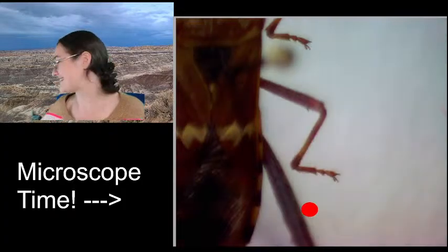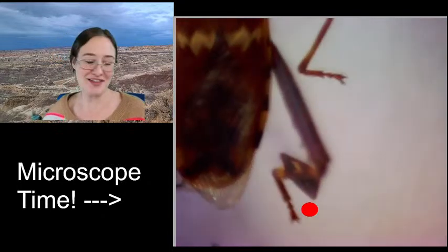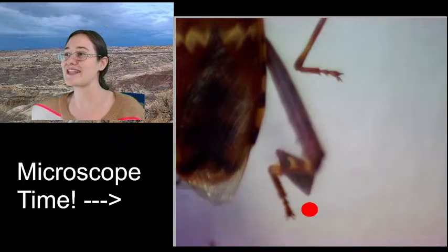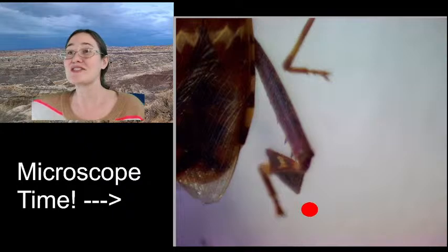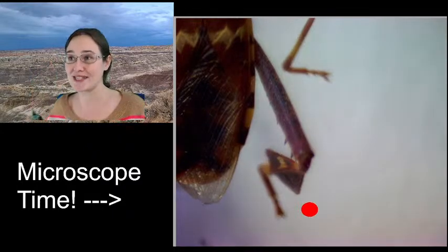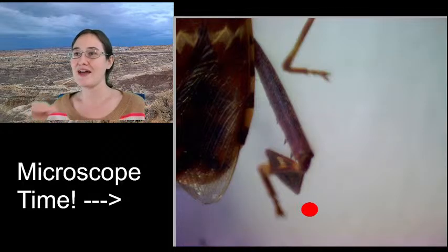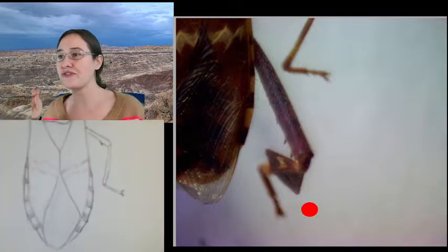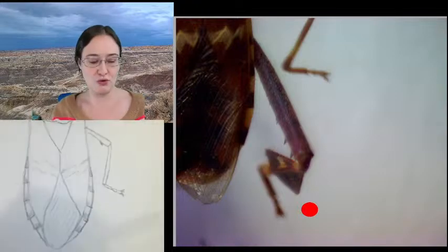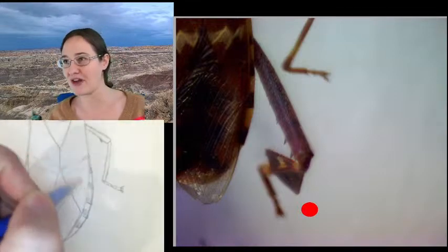Cool. Then the hind legs. The hind legs are the most awesome, but they're a little less awesome from the dorsal side. So what I've been planning on doing is sketching the leg as we see it here. And then we're going to turn the specimen and we'll all be able to sketch the leg from a lateral point of view so that we can see all of the cool leaf-like features of our leg that help him kind of blend in with his environment.